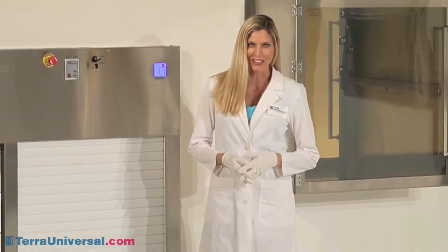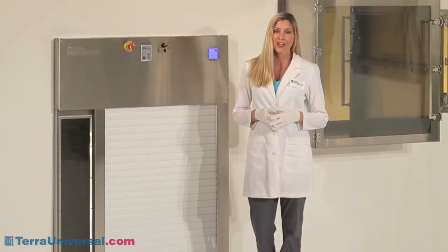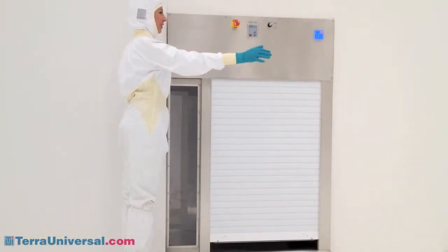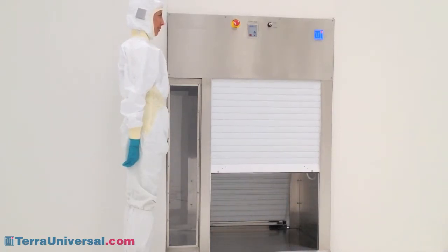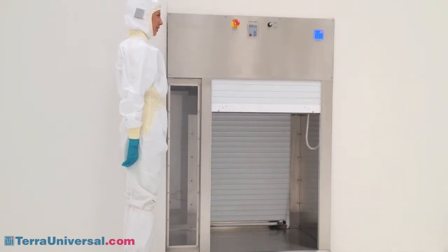Terra Universal's Roll-Up Door Pass-Through offers a convenient, non-contaminating way to transfer carts and other large materials in and out of a clean room. By providing a controlled, interlocked transfer chamber, they prevent cross-contamination between a classified and unclassified space while reducing clean room foot traffic and associated expenses.